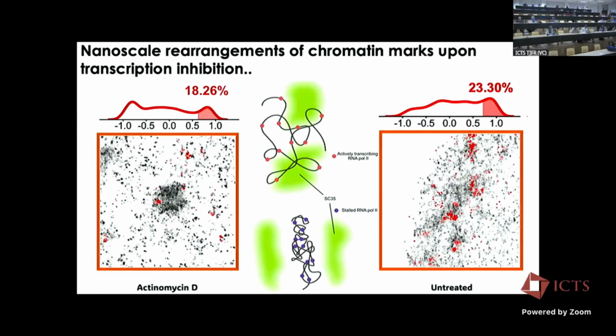One last question. I know it's very hypothetical and very difficult to do, but is there any way we can integrate this technology into live cells? I know it's very difficult, but I think this comes up in every presentation we give. The main issue is that you're working with DNA strands. Getting these DNA strands into live cells is tricky. Plus, live cells will be moving around, and we need something static to localize this. So I don't think DNA-PAINT at this point is capable of live cell imaging.